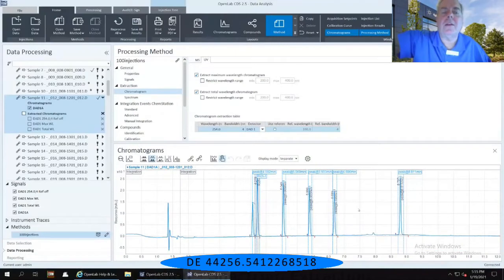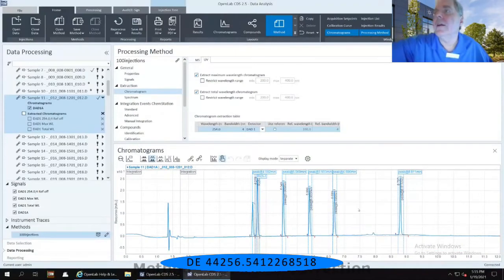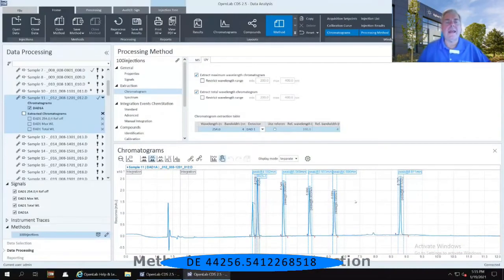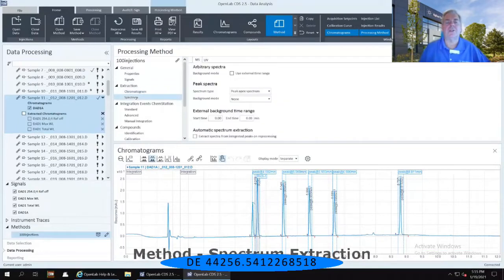Immediately below that chromatogram, there is a spectral extraction that I can do.